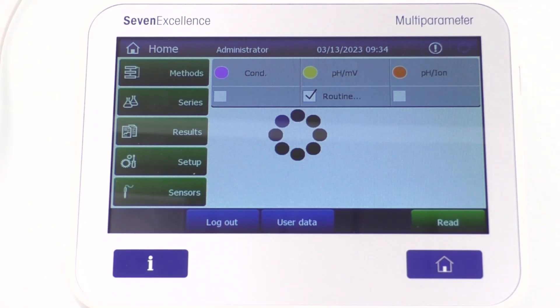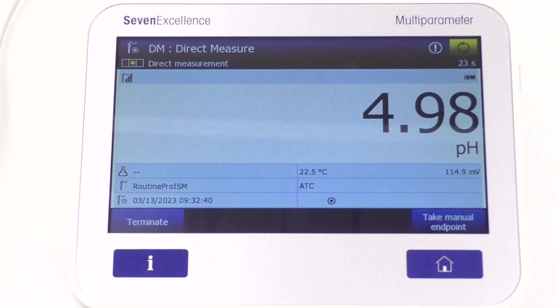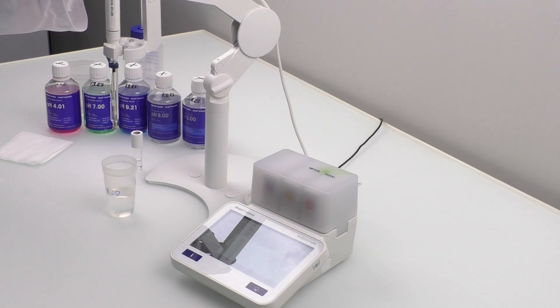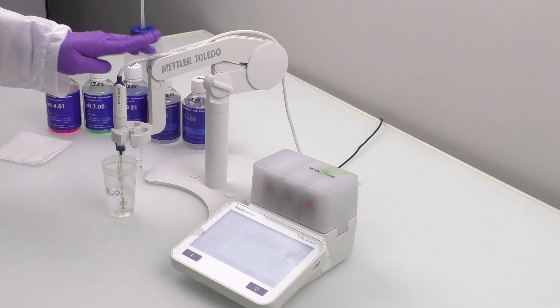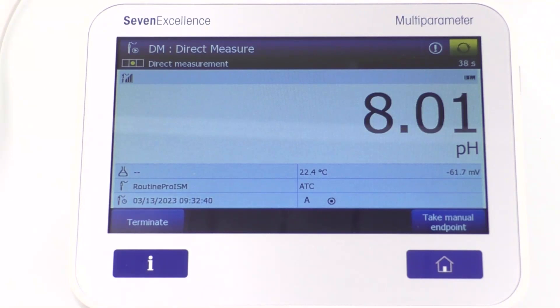Press read on the meter to start the verification. You'll see the reading on the meter, which you should wait for it to stabilize before removing the sensor from the beaker. Repeat the same verification procedure with the pH buffer 8.00. You'll notice that both verification results lie within the tolerance of plus minus 0.05 units, which is great news.